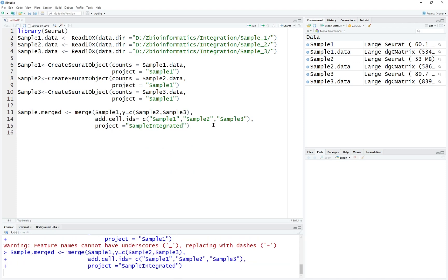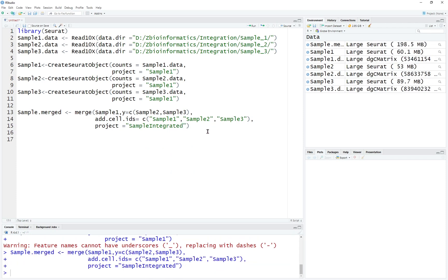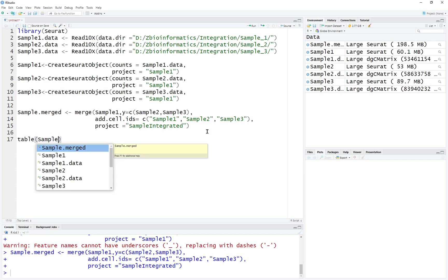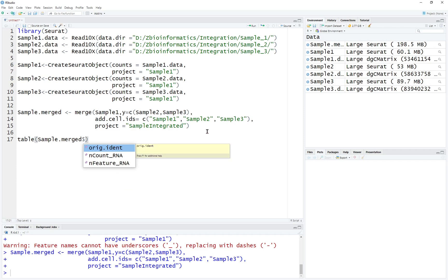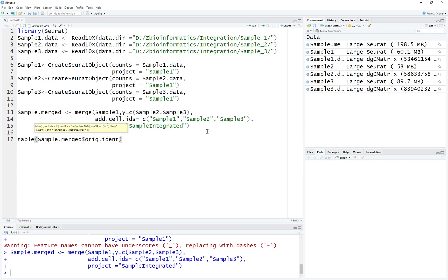Execute this command. After the merge, you can check the table. We can check the original identity, which is going to tell you where the data comes from — this should be sample 1, 2, and 3.